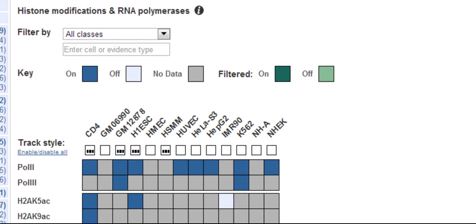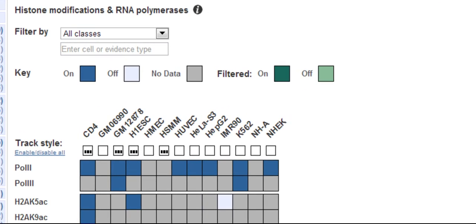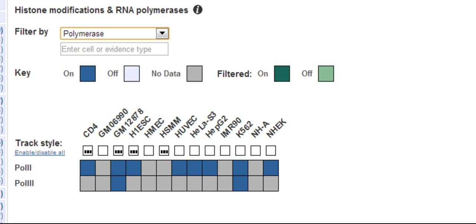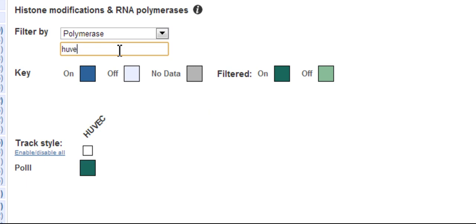If you're only interested in polymerases, for example, you can choose them in the filters. This simplifies the matrix. You can even type in one cell type if you don't want to see the others, for example, HUVEC cells. Or type in a particular histone you're looking for, maybe it starts with H2BK.